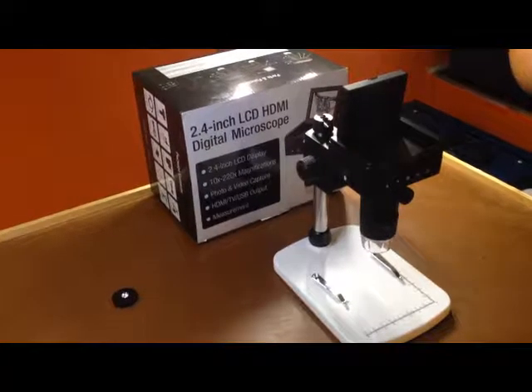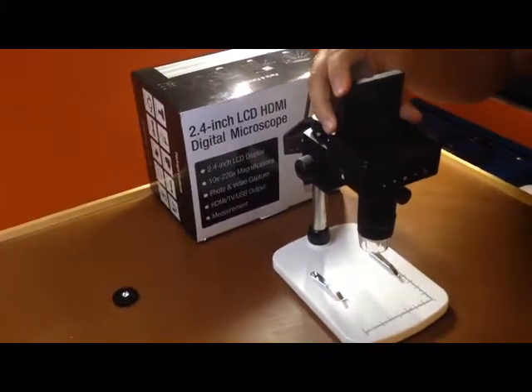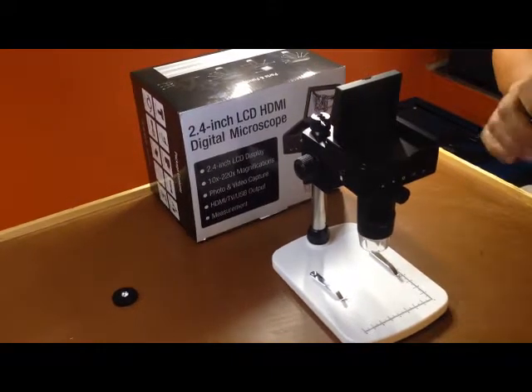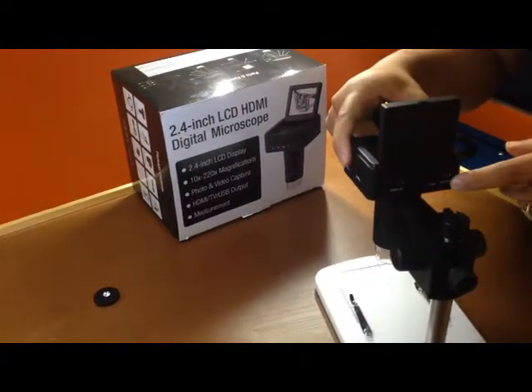Good day. Today we are going to be discussing the portable digital microscope. This microscope is supplied with a 2.4 inch LCD display screen. However, should you like a bigger display, you could link it up using your HDMI or via USB.